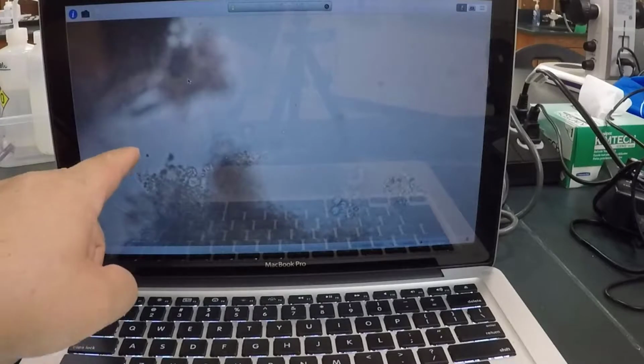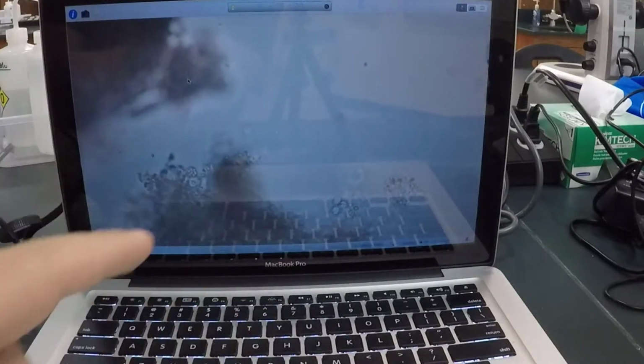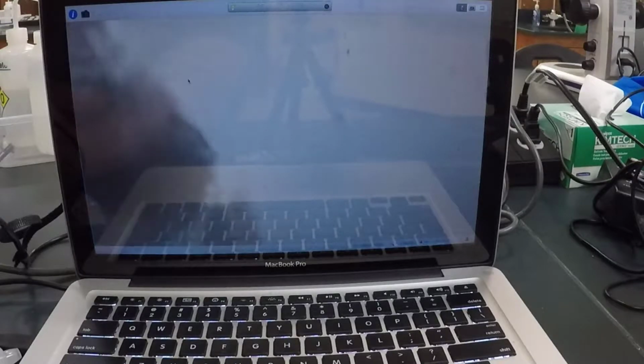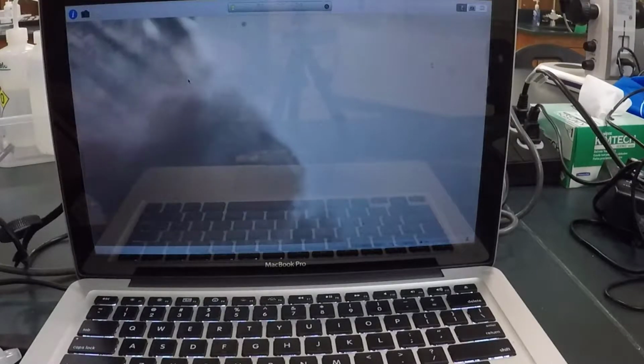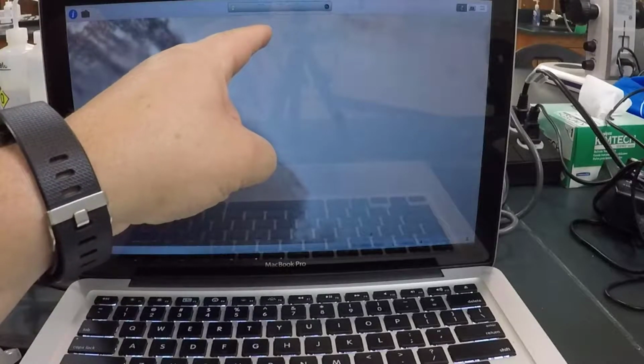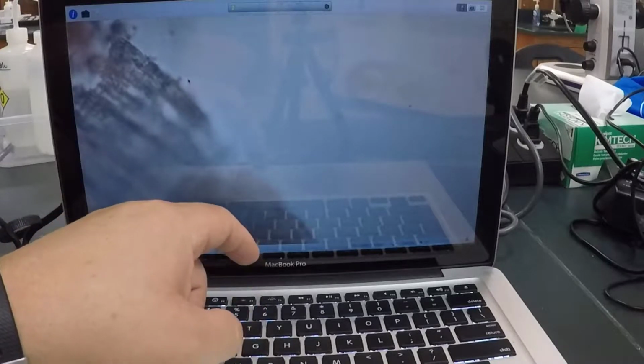You also see really small things moving through occasionally, extremely fast. Those are normally ciliates. They could be rotifers also, things that move fast, like here, that is a Chilomonas. That was moving with two flagella.